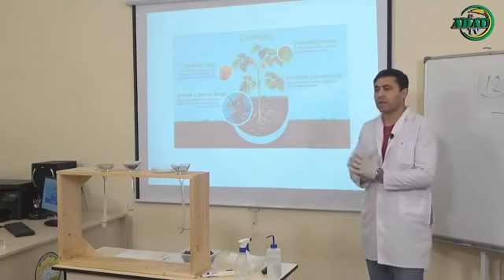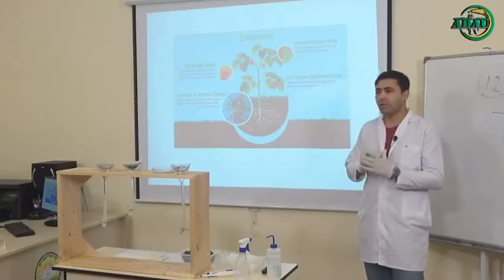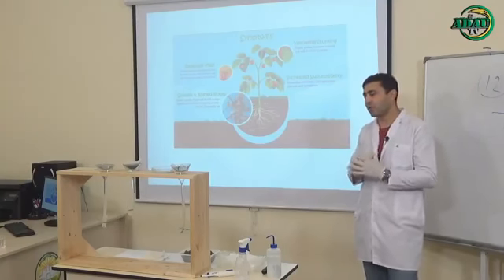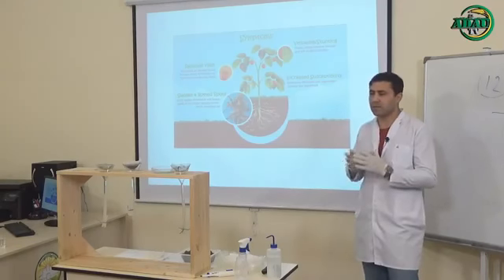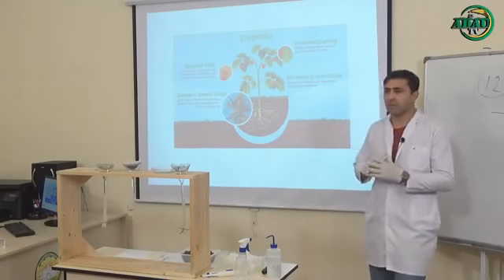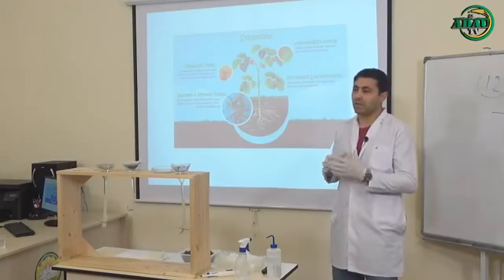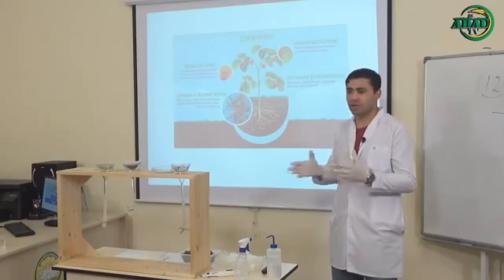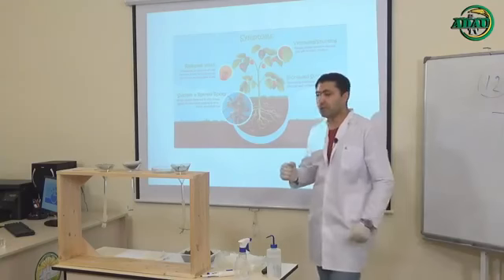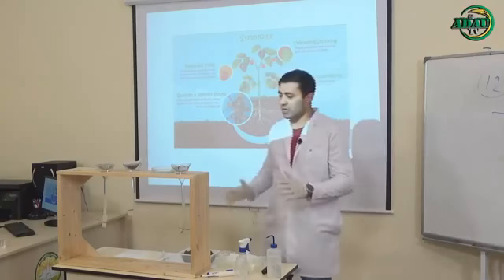So, at the end of the presentation, what we learned today is how we can diagnose pathogens, how we can diagnose nematodes in laboratory conditions. Actually, we have to do this in the field, also in laboratory conditions, but unfortunately, again, I am telling you, right now we do not have these conditions, and you can make this kind of tools in your laboratory.